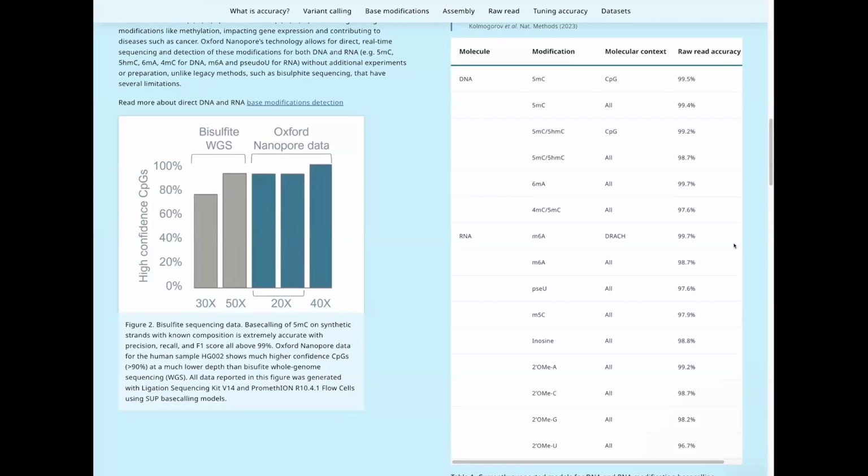The other thing to consider is the volume of data and samples that you're working with. For most of the groups that we work with that are working on really large scale projects, they tend to use high accuracy almost always. They're going to use high accuracy calling because for all of the variants that they're calling, it's good enough. It's just about the same as sup, but a lot less time is spent on the base calling. If you wanted to, you could always take one of your data sets and base call it with both approaches and compare the results, to see how much disagreement there actually is.